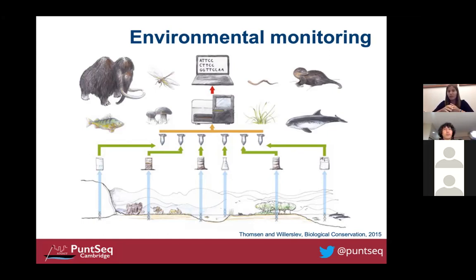I know that many of you are interested in using nanopore sequencing for viral detection, and obviously that can be done as well. But in this case we thought, because it's known that so many waterborne diseases come from bacteria, such as cholera and leptospirosis, that for now we are going to focus on bacteria. I still hope that for those of you who are only interested in viruses, some of the protocol optimizations that I'm going to show you now will be helpful.